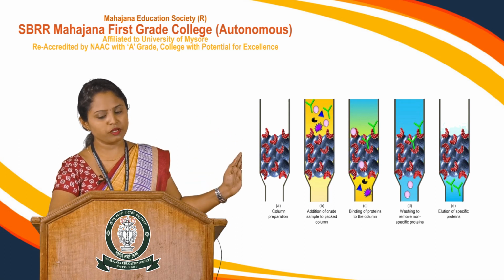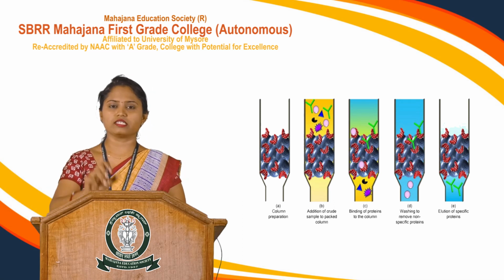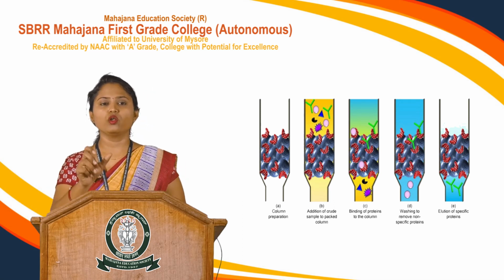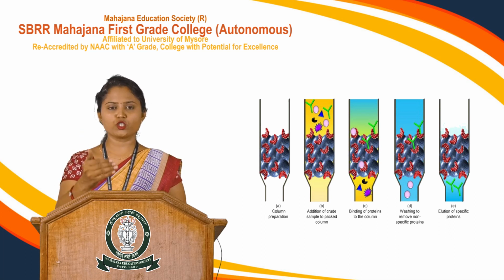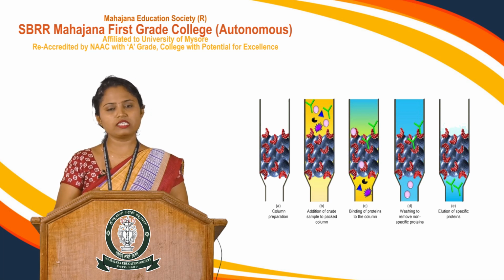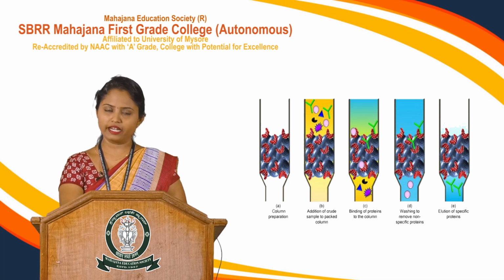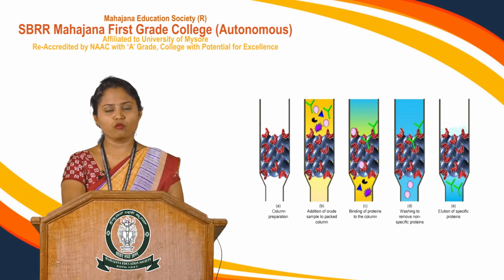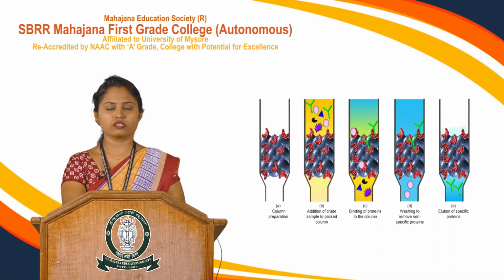Once the column has been packed, the next thing is to add the sample inside the column, which we call loading of the sample. As the sample is loaded, the mixture of analytes migrate and get separated based on their affinity. The molecules with affinity remain held or bound to the ligands, and the other molecules are washed out.